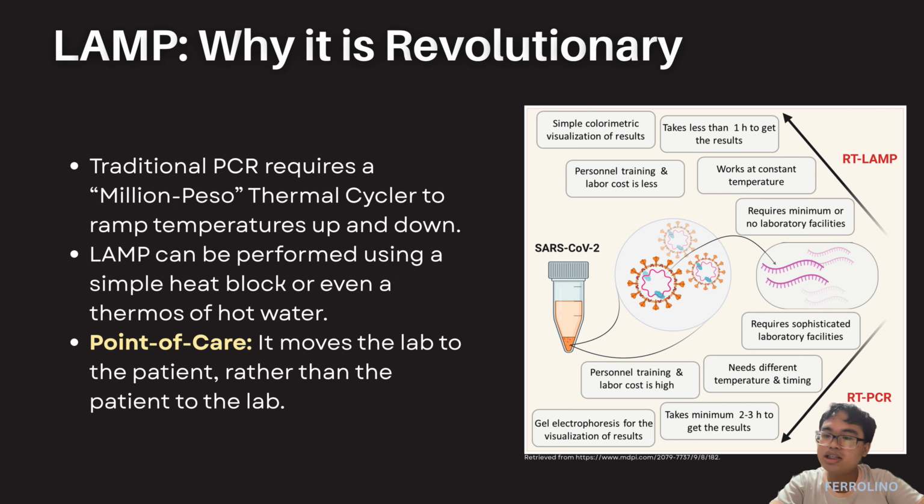Furthermore, the incorporation of dNTPs into the DNA polymer releases protons, causing a drop in pH. These allow for colorimetric detection using pH indicators such as phenol red or hydroxynaphthol blue. This chemistry eliminates the requirement for gel electrophoresis or specialized optical sensors, facilitating point-of-care, or POC, diagnostics in resource-limited endemic regions.